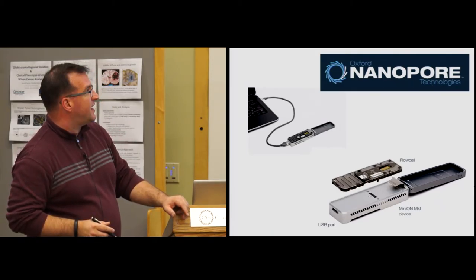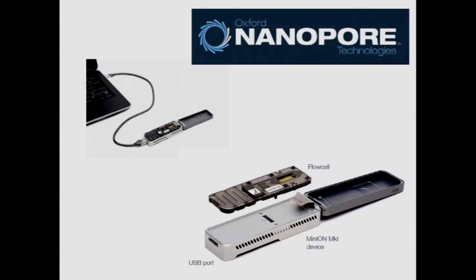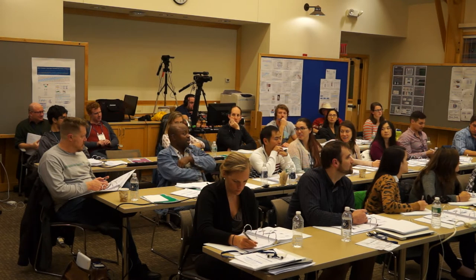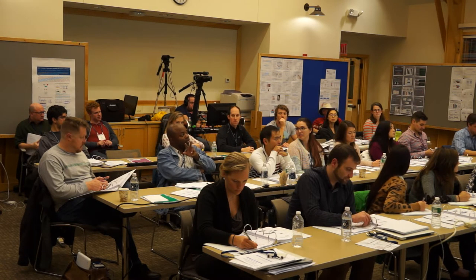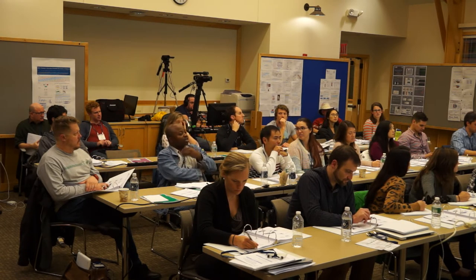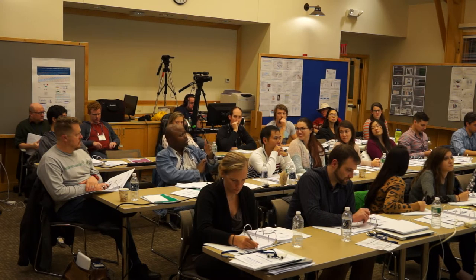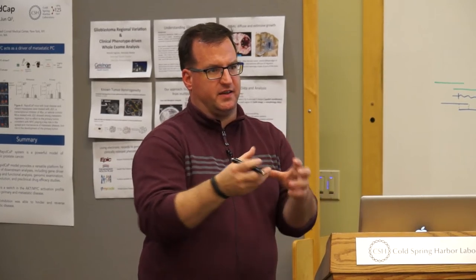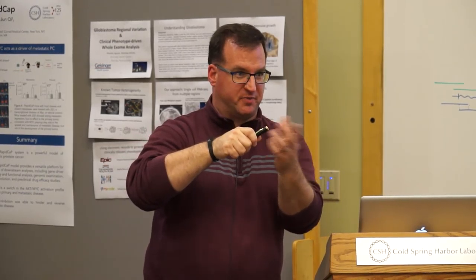Great. Oxford Nanopore is the last technology we're going to talk about. So we're going from, somebody asked me at dinner how big the PacBio machine is, and I have actually stood in front of one. It's big. It's a really big machine. How much is it? It's a lot. They're all expensive. What did you say, Dan? $750. $750? Yeah. They bought two of them. The machine's not changing, but the reagents and the chemistry and the consumables change. So the razor blade handle itself stays the same, but the razor blades that you have to plug onto it get better.